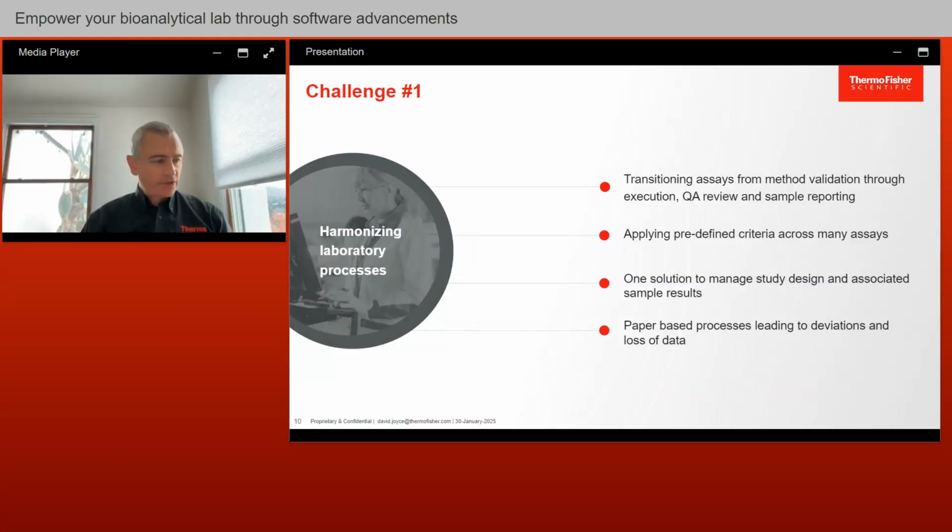It's a very specific process that you need to go through in order to create a method, validate it, and get it into the execution space. There's a number of different steps that you need to go through, and each one of them has to be carried out correctly before you go to the next. And then you need to be able to carry those assays out in a repeatable and consistent manner. So that's not easy.